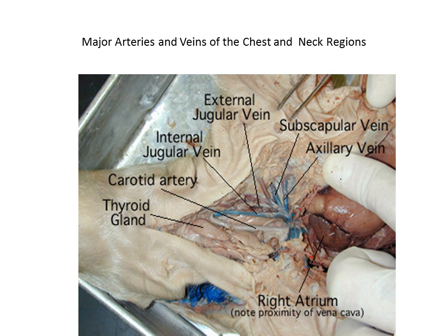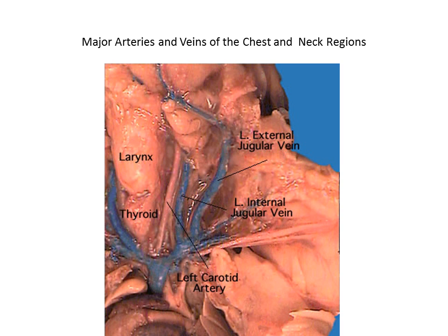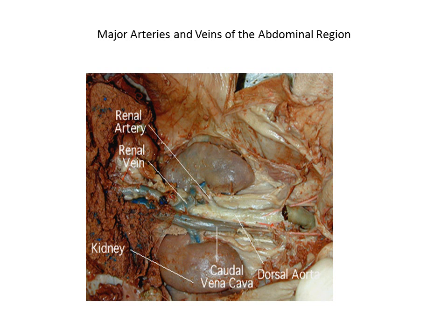So that's another view, and I don't think I can add too much by talking about it again. There's a lot of vasculature associated with kidneys. We will deal with them specifically in the urogenital and excretory section.